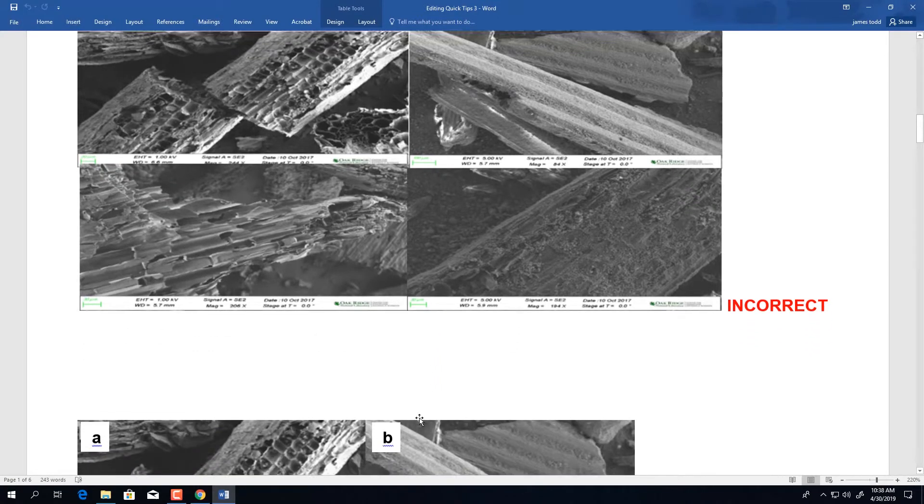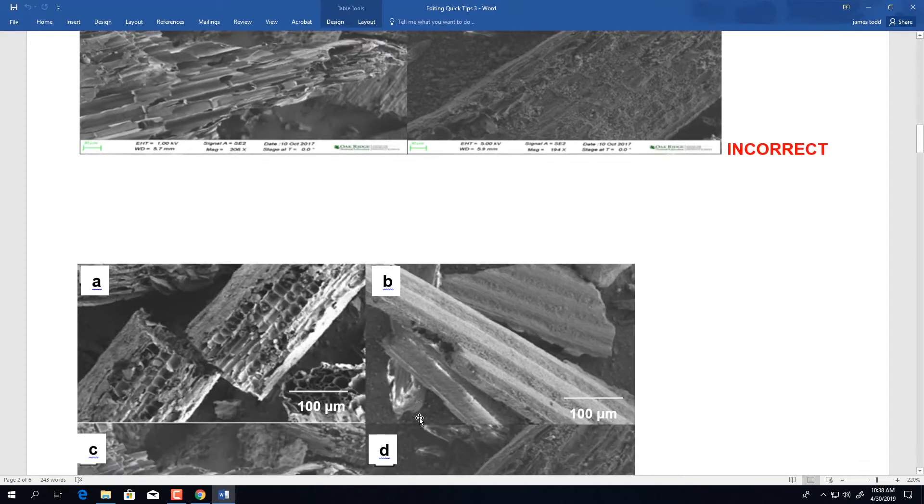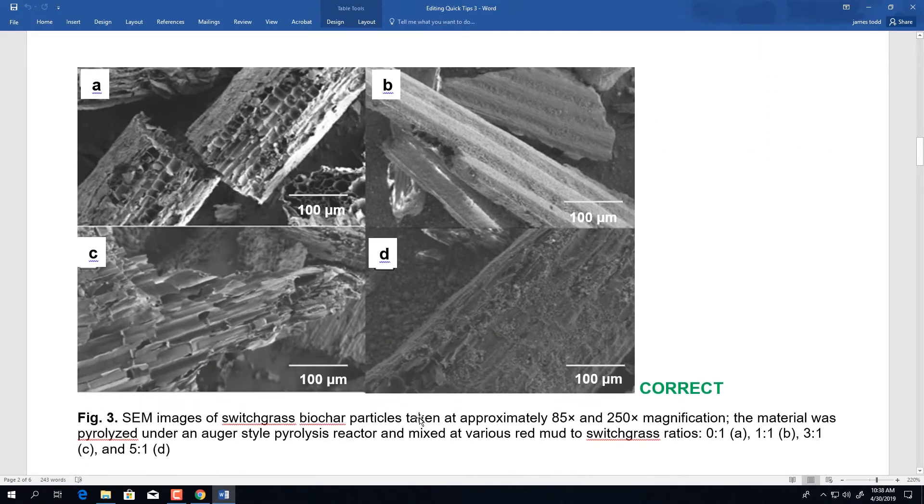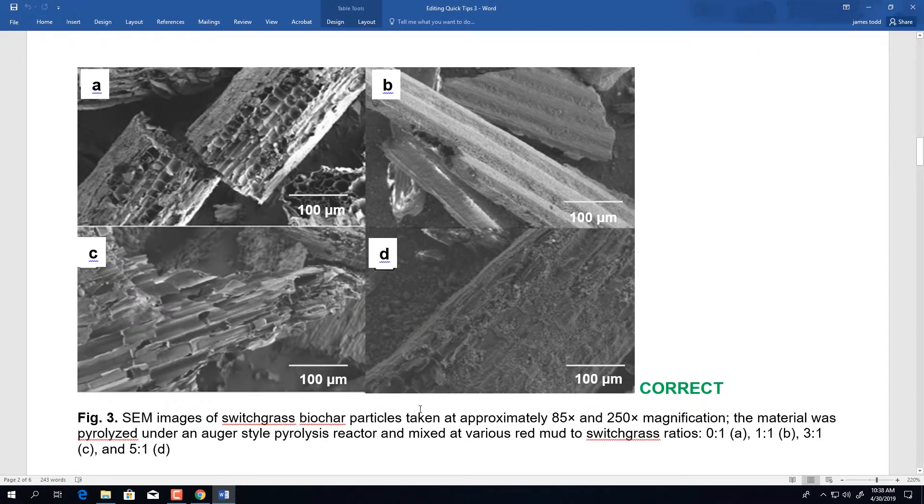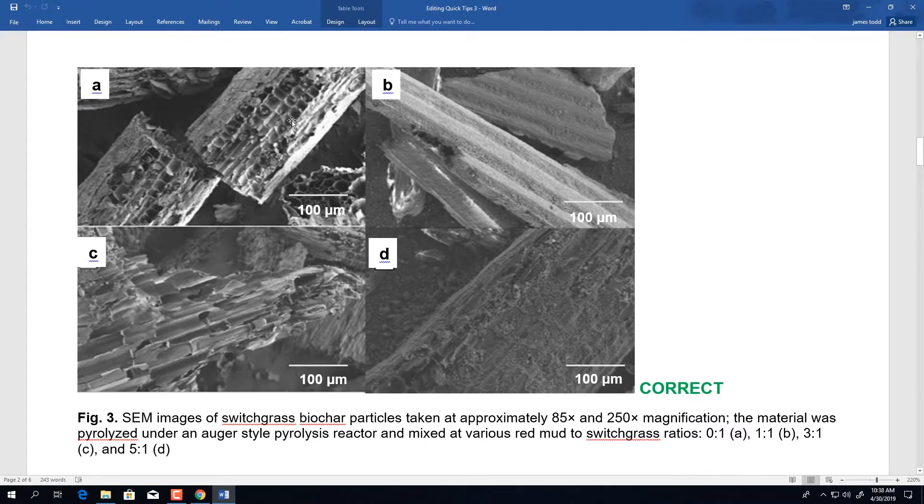If we look below, the correct guidelines are followed in this set of images. We have our panel letters located in the top left corner in a legible font.